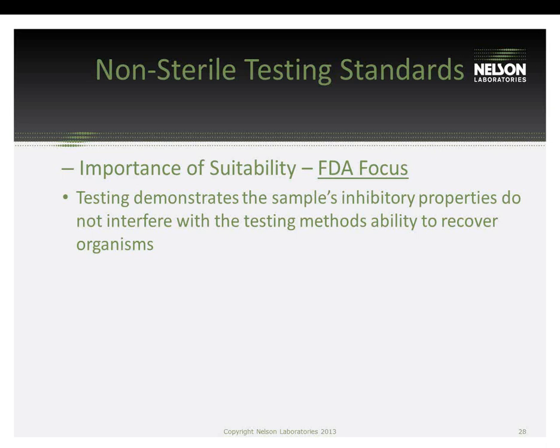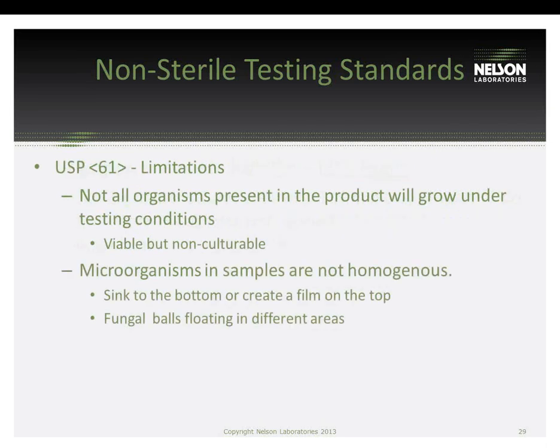So during the testing with suitabilities, the sample is actually inoculated with a set number and types of organisms, run through the test, and growth has to be recovered compared to a positive control, a 50 to 200% recovery. And again, that shows that the testing is valid and that you're not getting false negatives.